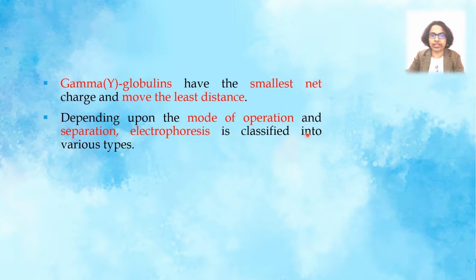Depending upon the mode of operation and separation, electrophoresis is classified into various types.